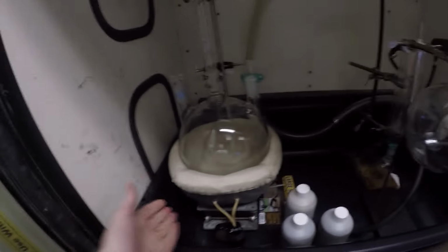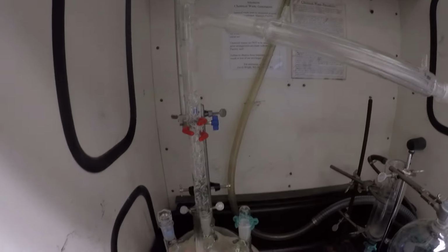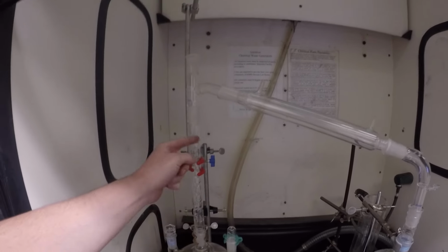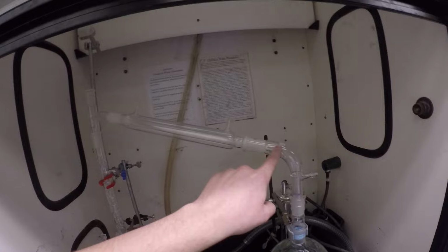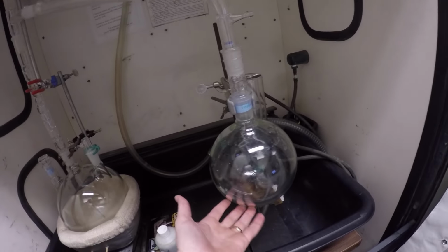I may just end up tacking this on to the end of the video to show the really up-to-date stuff, after what I just explained. So basically, to recap, we've got the heating mantle here, the round bottom flask, and this is a Vigreux column. Yeah, it helps purify the vapor. The vapor will condense here as the water is circulating through it and cooling it off, and then it will become a liquid and drip down into this containment vessel.